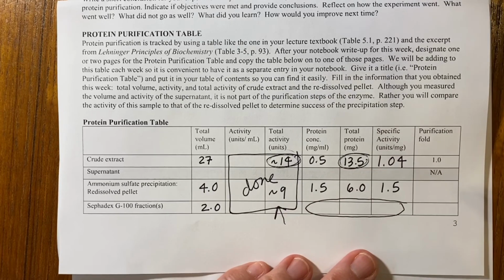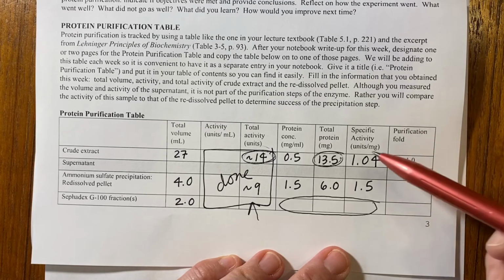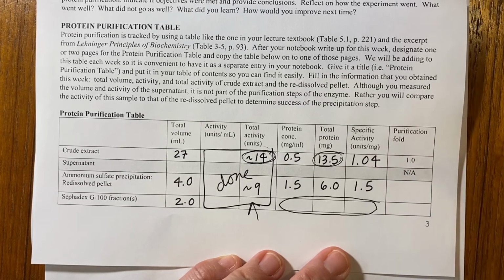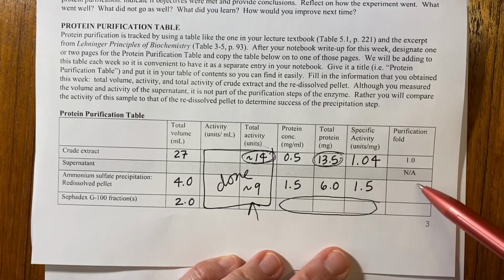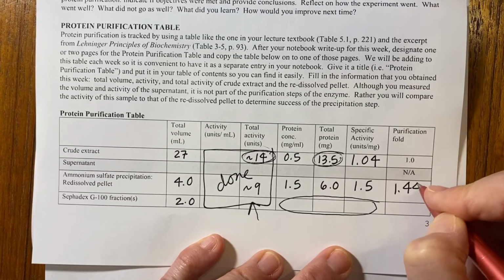But the last thing I want to show you is how to do this part. So purification fold is this number divided by this number. Or in the case of the first row, it's this number divided by itself. That's why you get 1. So to get this box, we take 1.5 and we divide it by 1.04, which is roughly going to be 1.44.